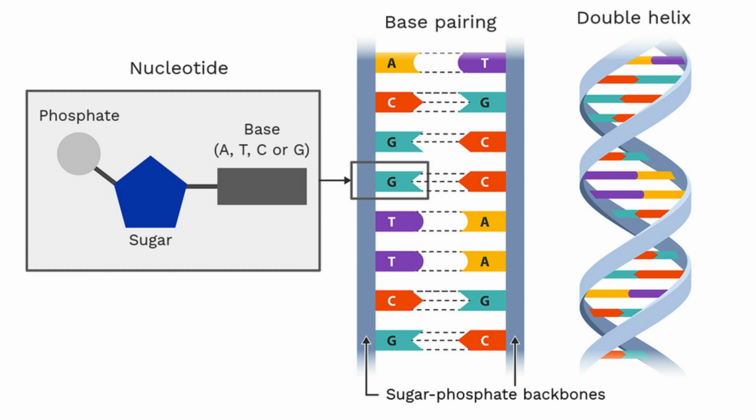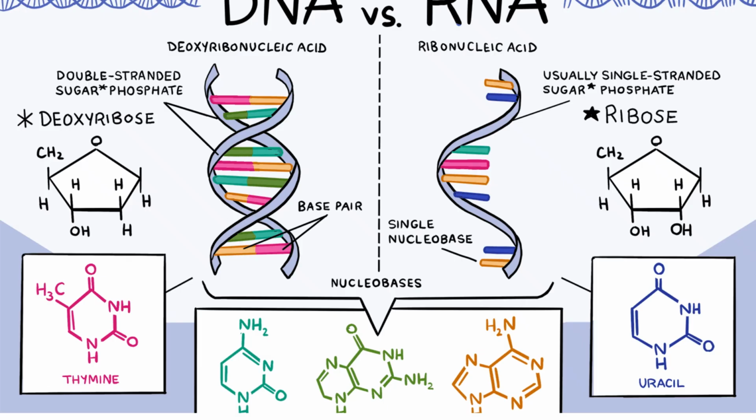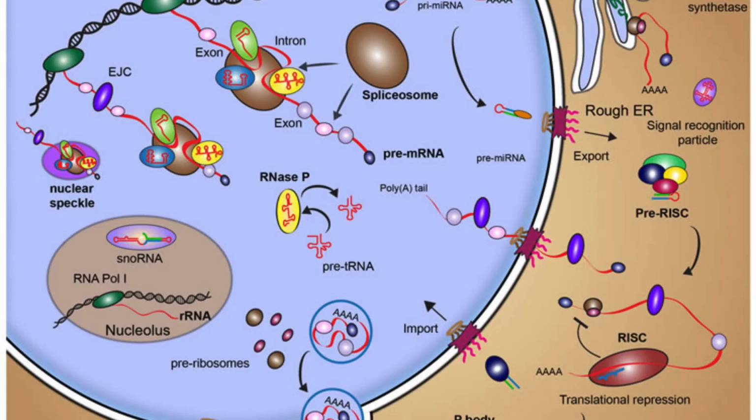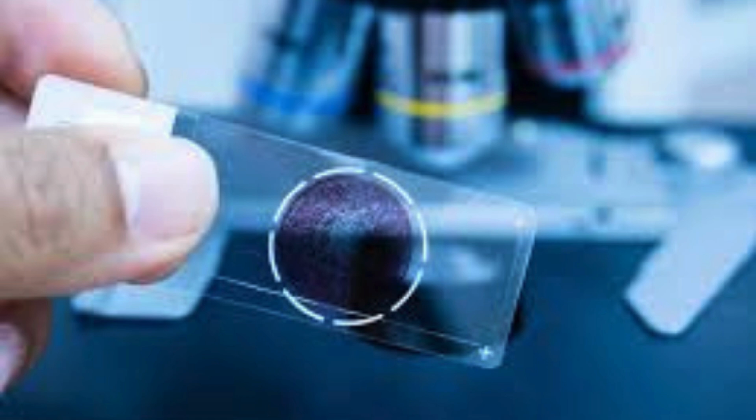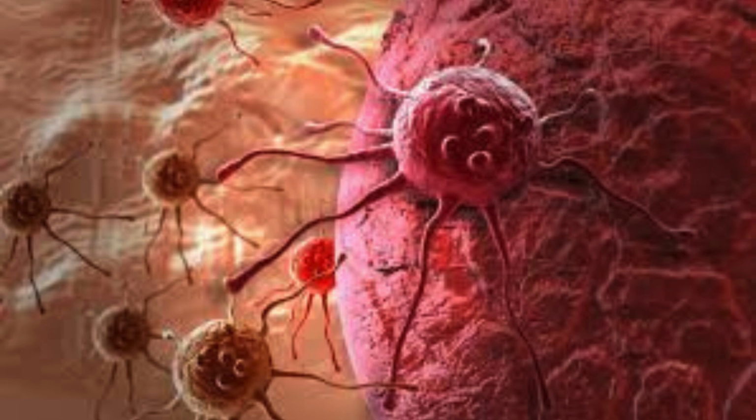It is applied to reveal the content of the nucleus in cells because it is attracted to chromatin and nucleic acids. Eosin. Eosin is an acid dye that gives pinkish or red colors to the cytoplasm along with other basic cell constituents. Structures containing collagen, extracellular matrix, and cytoplasmic proteins are all eosinophilic. H and E stain is considered one of the most useful tools in discrimination of normal from abnormal tissue architecture. The contrast between the nucleus and cytoplasm is excellent using this stain.